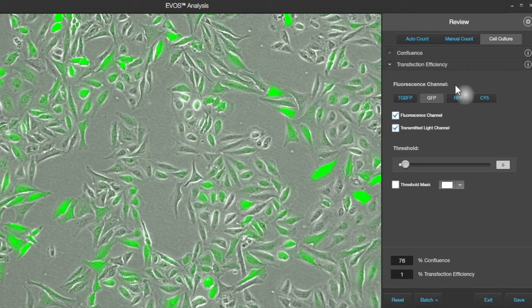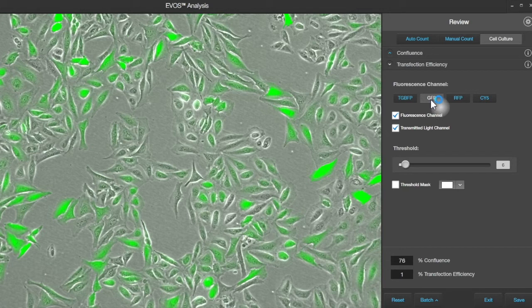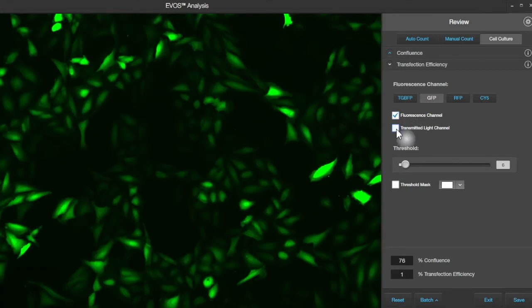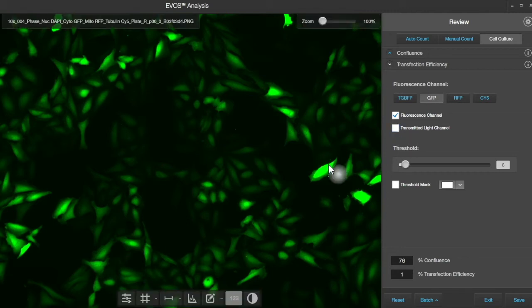These are the fluorescence channels that are available with this data set, and it's on GFP right now, which is the correct one for looking at expression of GFP. Both of the channels are being shown here — fluorescence and transmitted light. We can turn off the transmitted light and see what the pure fluorescence signal looks like. We've got very bright cells and very dim cells.